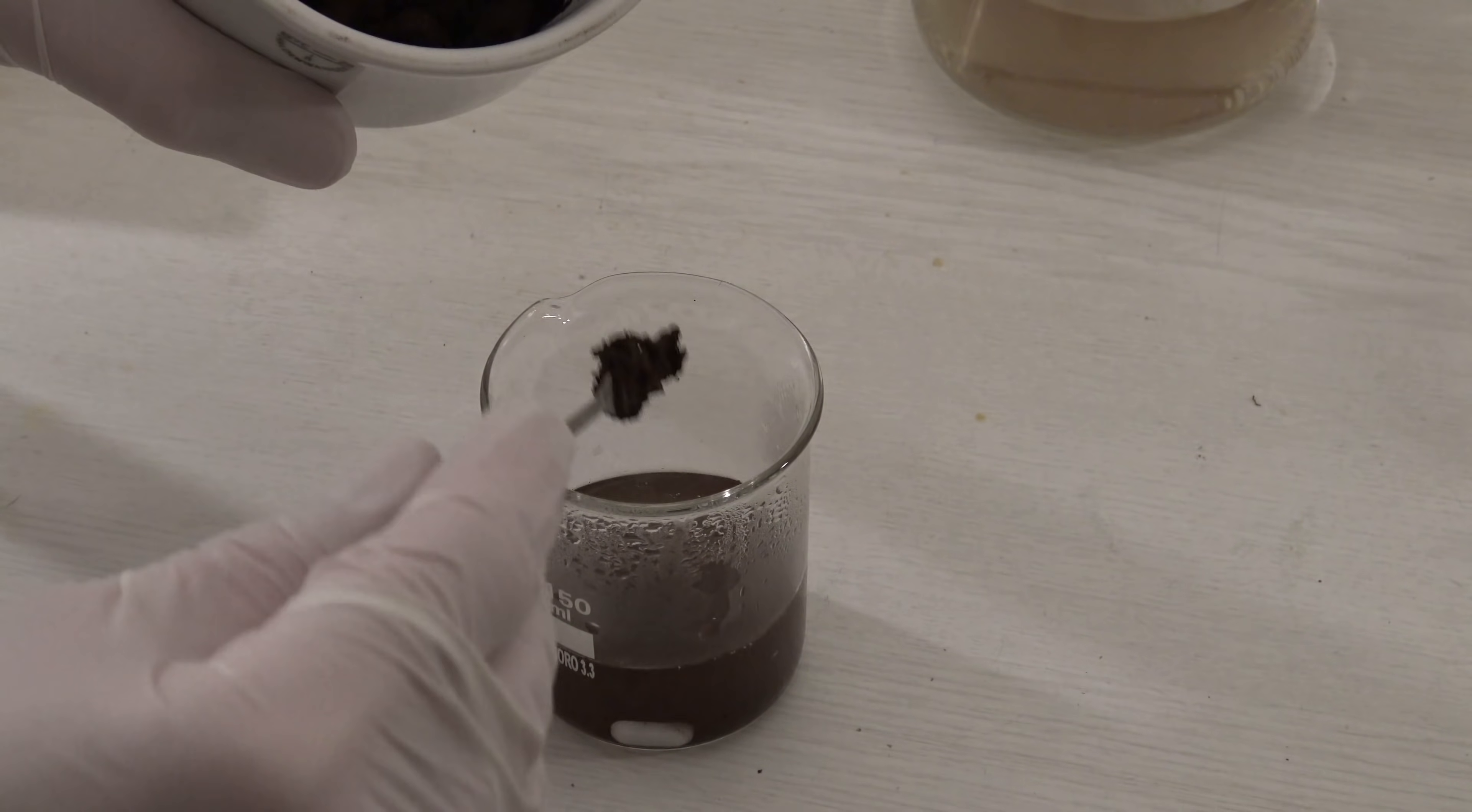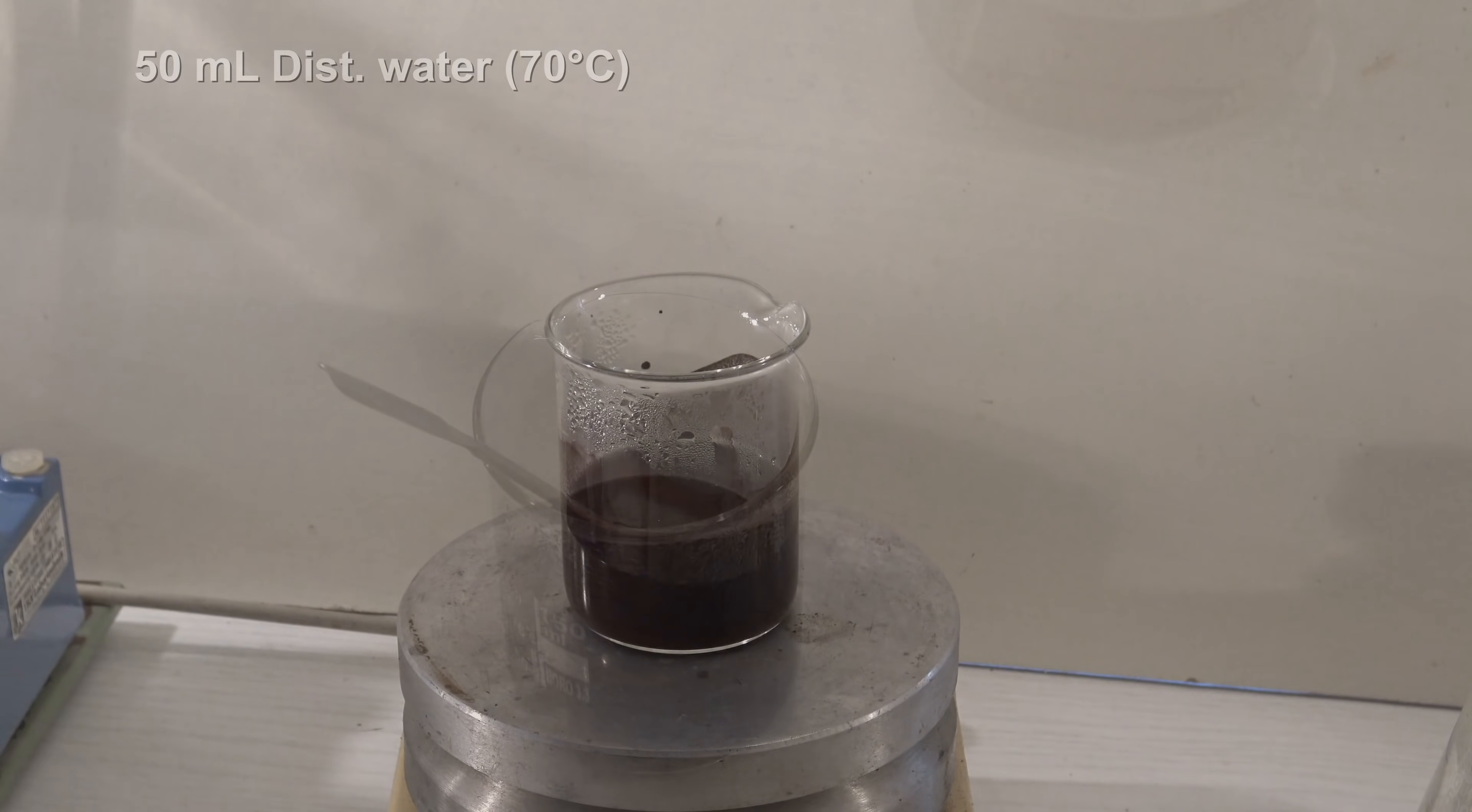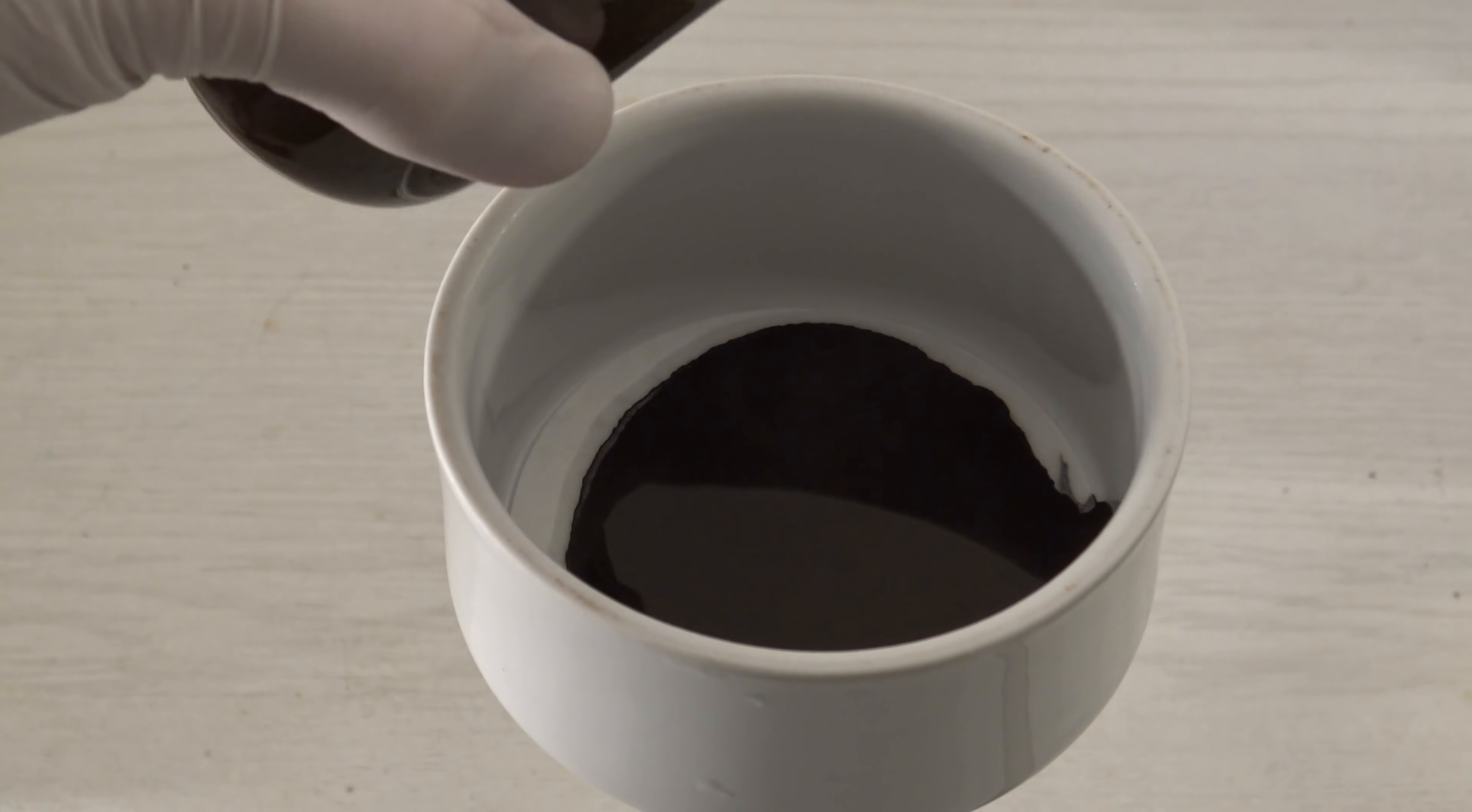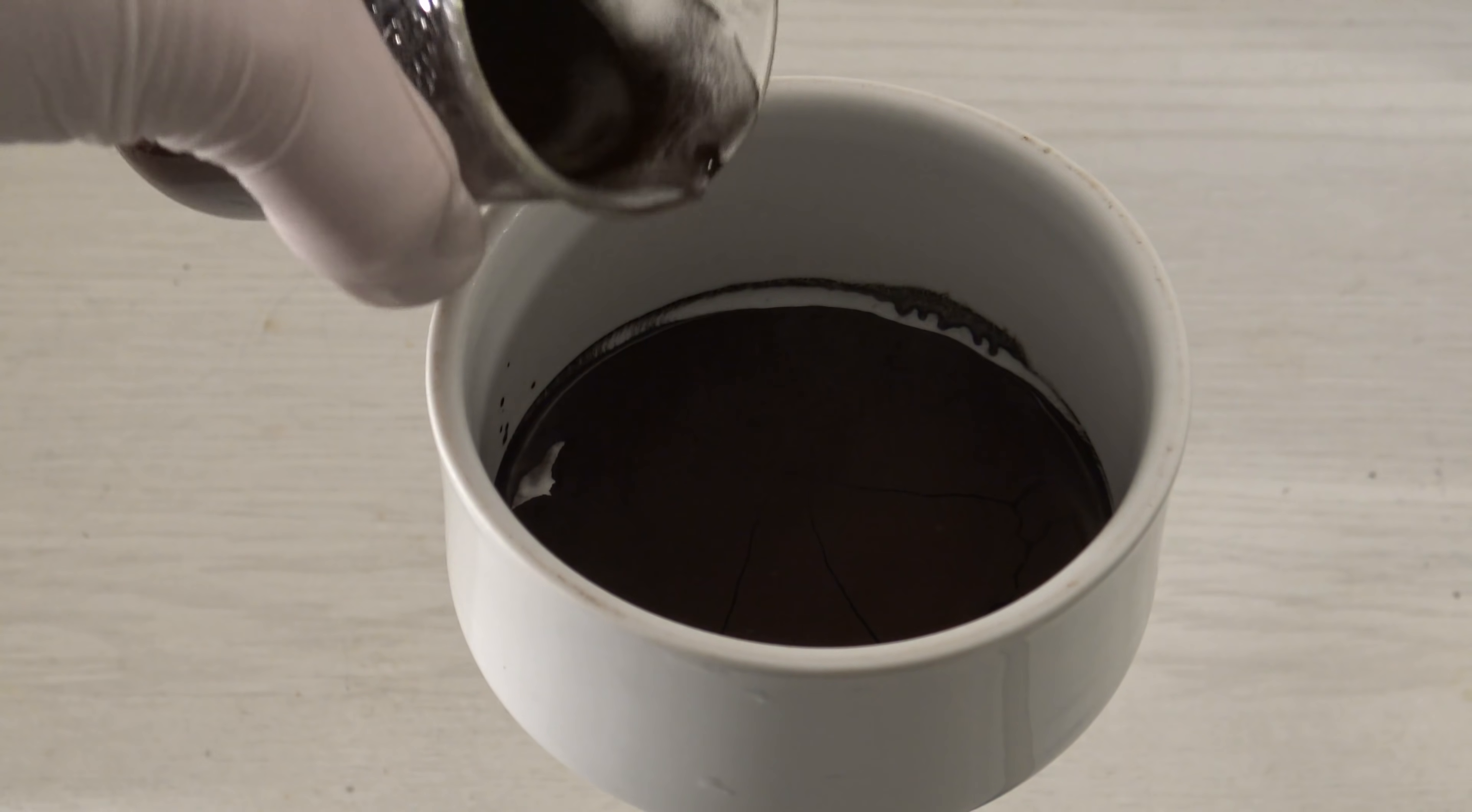After that, the manganese dioxide was added to the residual 50 milliliters of the distilled water. The mixture was then left to sit for 10 minutes at 70 degrees Celsius. This helps to remove last traces of product. The manganese dioxide was filtered off again and the second filtrate was added directly to the first one, while more of the dioxide did pass through the filter.